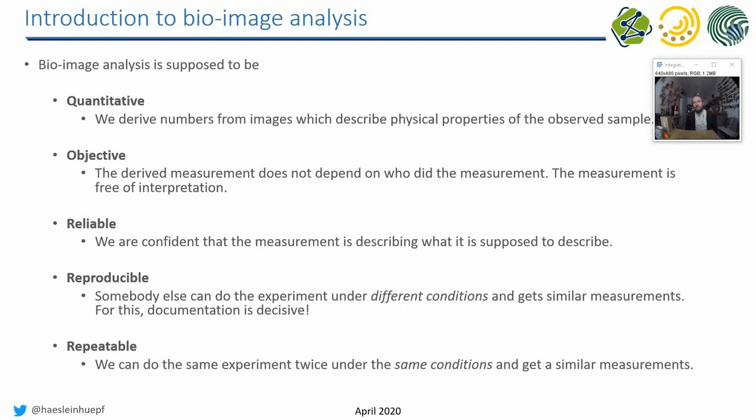It's actually quite important also in deep learning business. More and more people are calling for that. If possible, image the same image twice, please do that, because then you have two images which show the same scene. And if you then apply, for example, deep learning algorithms to that, you can investigate how the influence of, for example, noise is on the result of your post-processing with deep learning techniques.